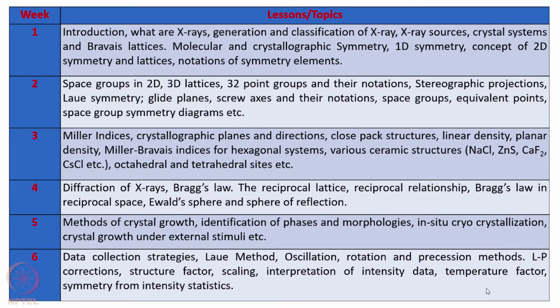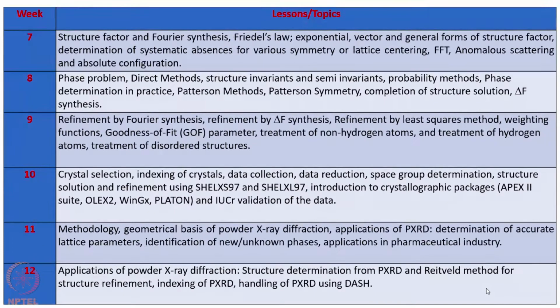Then we will talk about data collection strategies, Laue method, oscillation method, rotation and all that, and then we will discuss modern day data collection procedures. Then we will talk about the structure factor, Fourier synthesis, Friedel's law and things like that, to give you an input about how to go about understanding the structure solution from a given data.